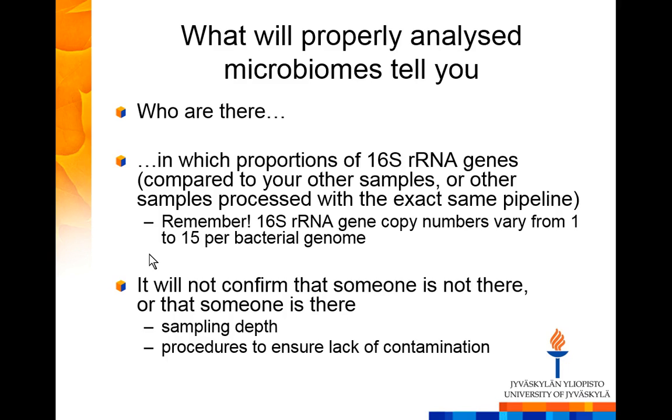But if you work with some environments with very low microbial diversity, and especially very low microbial biomass, you need to be very careful to make sure that what you find and have in your samples is not contamination. Contamination from DNA extraction kits, from PCR master mixes, those are very often, or actually almost always, a little bit contaminated. Or just contamination from your own skin, from the air in the laboratory. So just remember these when you get and analyze your data.